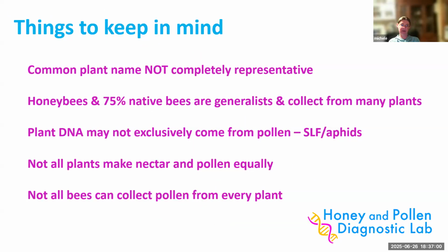So here are the things to keep in mind when you get this report. As I stated a little bit earlier, the common plant name is not representative. I had a hilarious question a couple weeks ago, because I didn't know this either. Somebody who lived in downtown Manhattan asked, why am I getting alfalfa in my sample? The genus name for alfalfa is Medicago. Turns out, a super common weed that grows between the cracks in the sidewalk, and yes, it flowers, is what they were getting. It wasn't actually alfalfa that they were seeing in their sample.